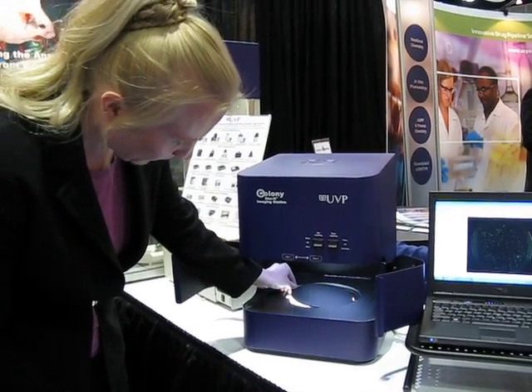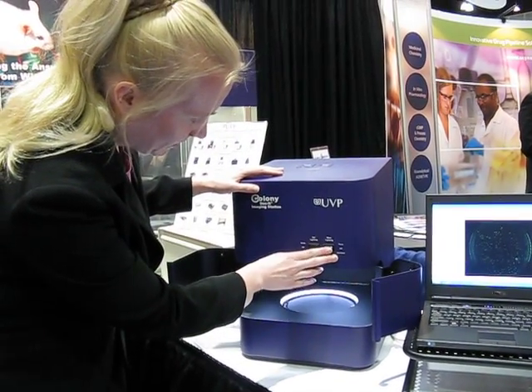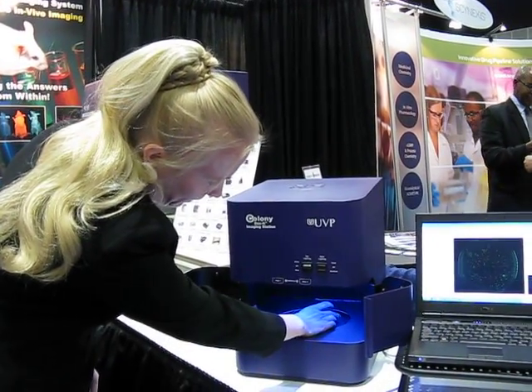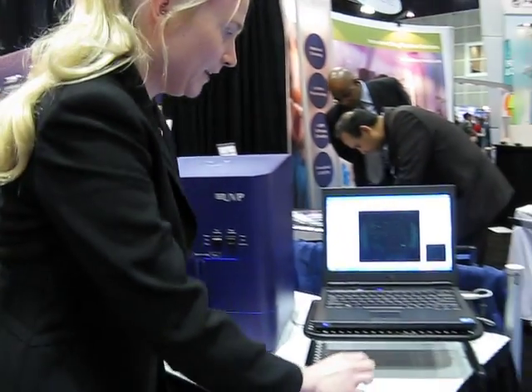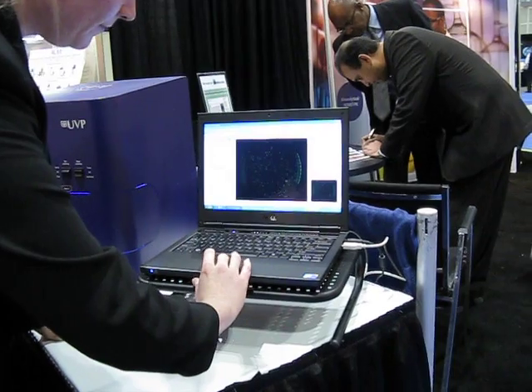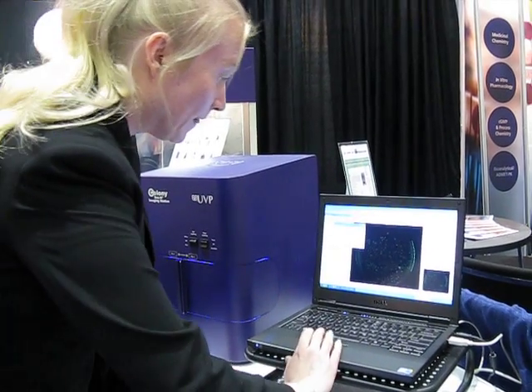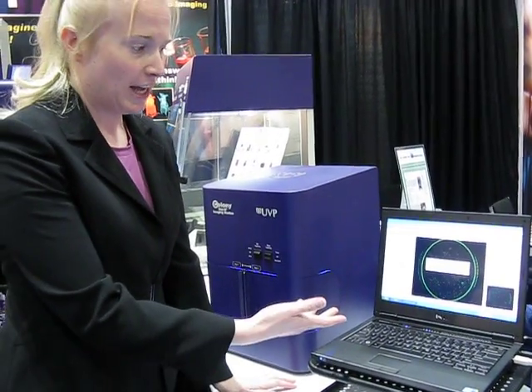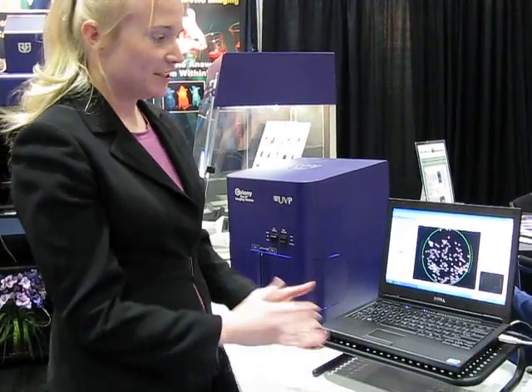I'm going to put the plate right back in, turn off the base lighting, and turn on the blue lighting. You put your plate in, you center it, you go ahead and close the doors to give you a dark room environment. You capture the image of your dish, and then you select start colony count. After that, you select automated colony count, and within seconds you'll actually get a count of all of your colonies. There you see we have generated 156 colonies. It's really as simple as that.